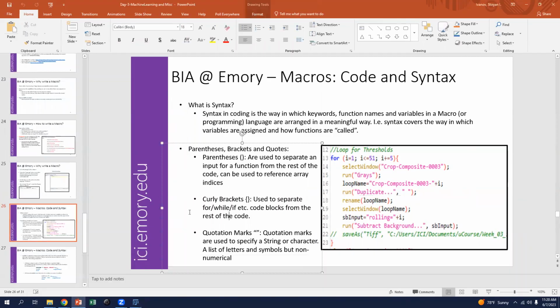Before we actually start writing code, let's go through some words and some symbology that's pretty common here. Like any language, even a macro language has syntax, has vocabulary in the form of functions, and has all sorts of things you could do.